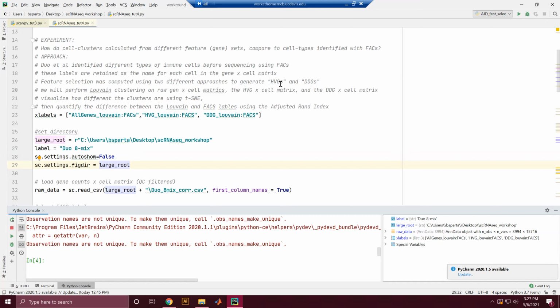And if we observe the gene in fewer cells than expected based on the average level, then we can infer that that gene is not expressed in a subset of our cells, so that gene is differentially distributed, meaning it's only represented in a subset of cells. And in that way, we think it might be biologically variable. So it's a way of measuring a difference in the distribution rather than a higher level of variance.